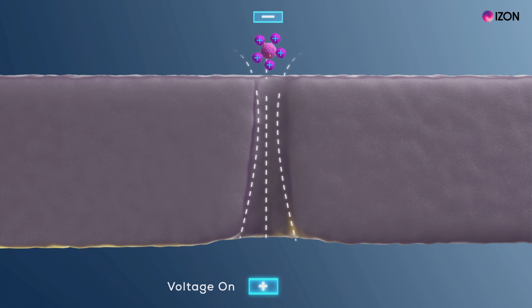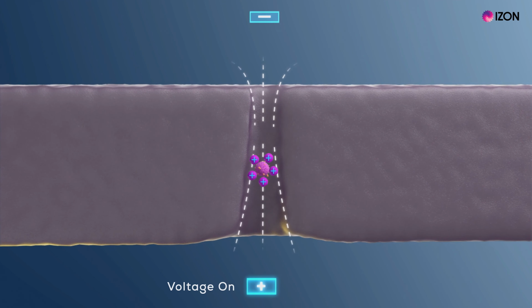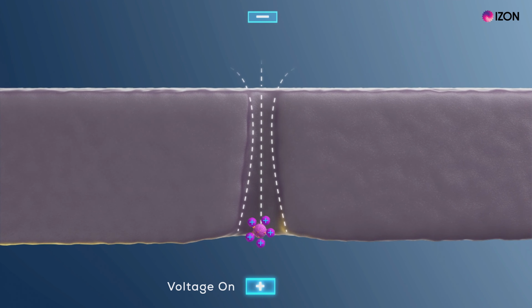In a standard TRPS setup, this means that negatively charged particles in the upper fluid cell are pushed downwards through the nanopore towards the positive electrode in the lower fluid cell. As with the electroosmotic transport, the magnitude of the electrophoretic transport depends on the strength of the electric field around the particles, the electrical properties and viscosity of the solution, but also the zeta potential of the particle instead of the nanopore. All transport mechanisms combined determine the flow and velocity of particles passing through the nanopore. This is reflected in the rate and the duration of the resistive pulse signal.